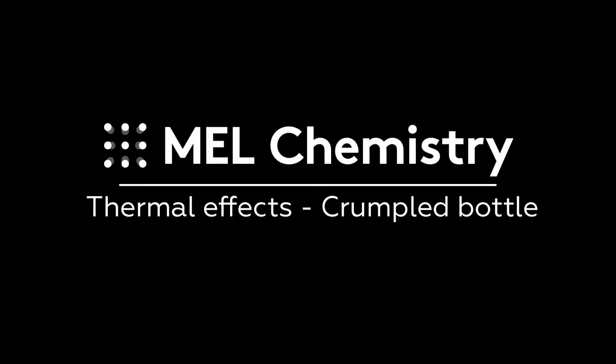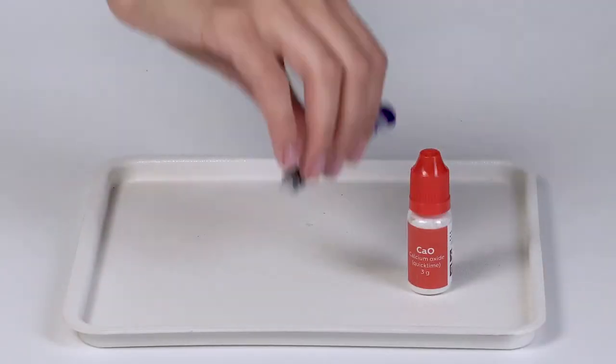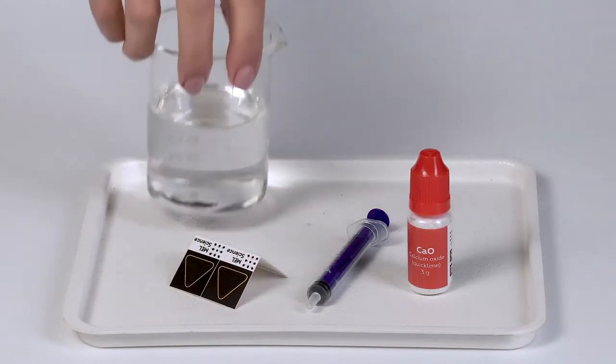For the crumpled bottle experiment, you will need a plastic tray, calcium oxide, a 5 ml syringe without a needle, a thermosticker, and water.